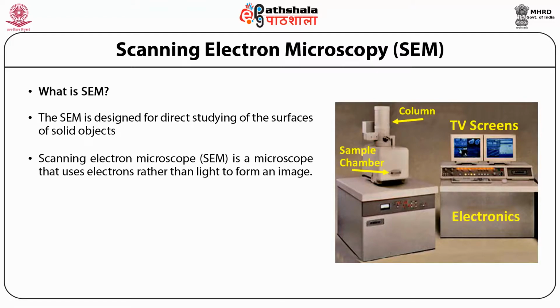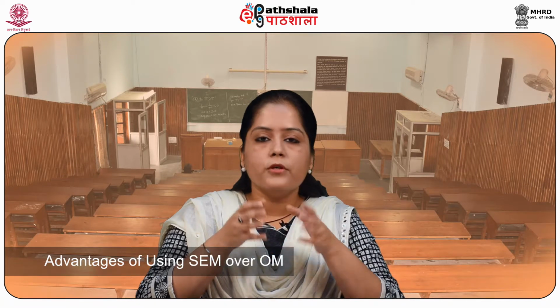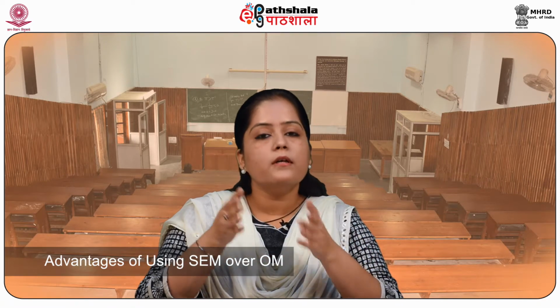Scanning electron microscope, SEM, is a microscope that uses electrons rather than light to form an image. As we know, there are enormous advantages to using the SEM instead of OM. So let us discuss the advantages of using SEM over OM.